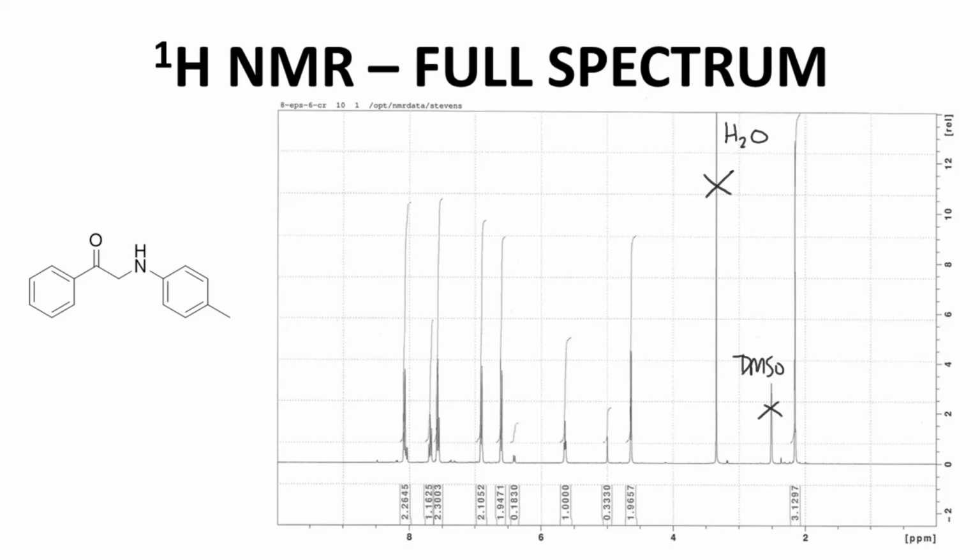Now let's look at the little impurities. Two peaks stand out. There is one at about 5 ppm and another around 6.4 ppm. In my mind, I'm expecting an aniline, one of the starting materials, specifically para-toluidine as an impurity. These peaks kind of match parts of para-toluidine. The NH2 could be this peak around 5.0.